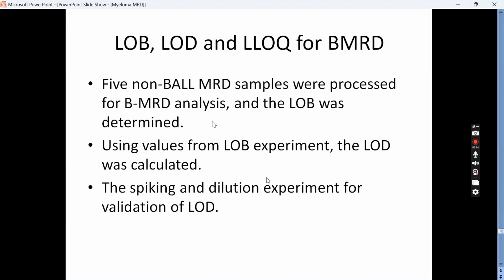For example, based on the LAIP, you would have drawn a template. So now you check how many of those events are falling in that MRD gate. When I say MRD gate, that is MRD events. It should be 19 positive, 10 bright, 34 positive, 38 downregulated, 73 overexpressed. So you check how many events are falling in that MRD gate, satisfying all these LAIPs.